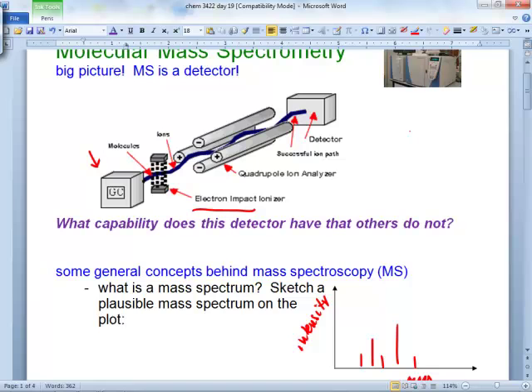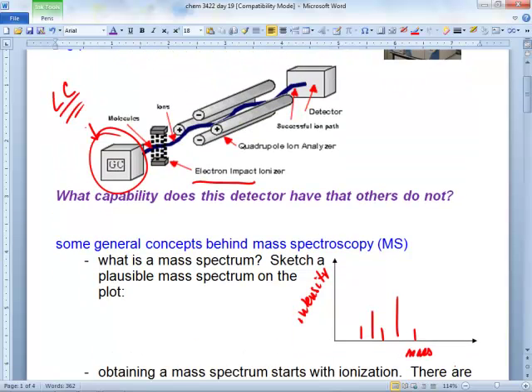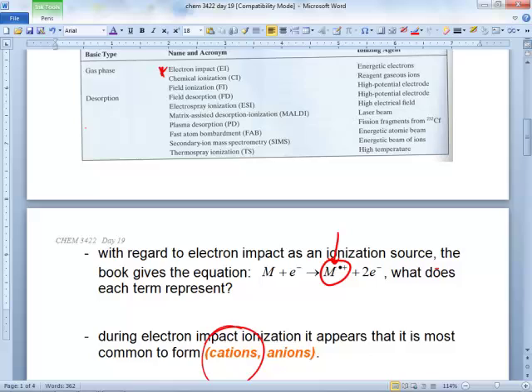Well, this is just the detector. This is what's come in the last 5-10 years, LC-MS. Just think how broad this is. Now you can shoot anything on that machine and have all the power of a mass spectrometer detector. Now it's a very expensive machine, and it takes a lot of maintenance.